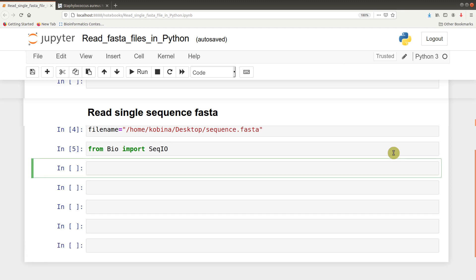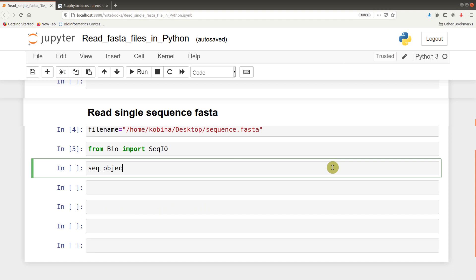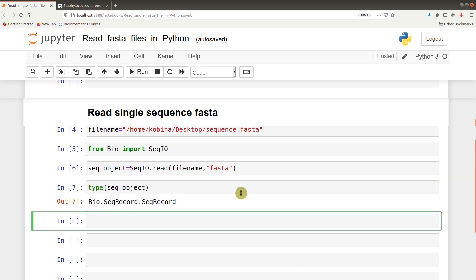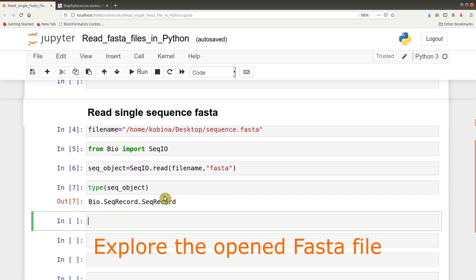After we are done with imports, we can proceed to read the FASTA file. Let's say seq_object equals SeqIO.read. We are using dot read because it's a single FASTA, it's only one record. You specify the file name and then you specify the file type which is FASTA. Now we are set. Let's say type seq_object. It's a Bio SeqRecord, that's how it gets it.